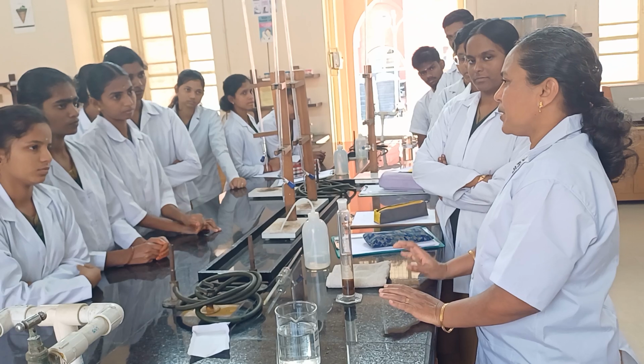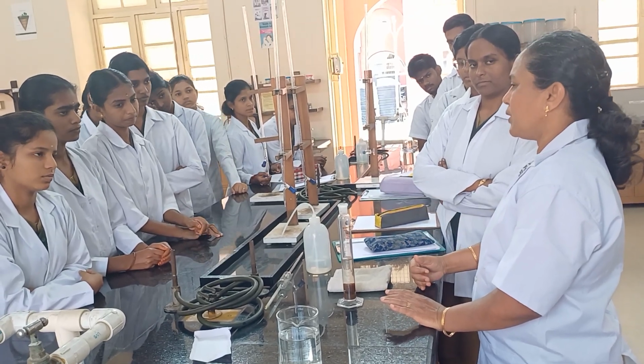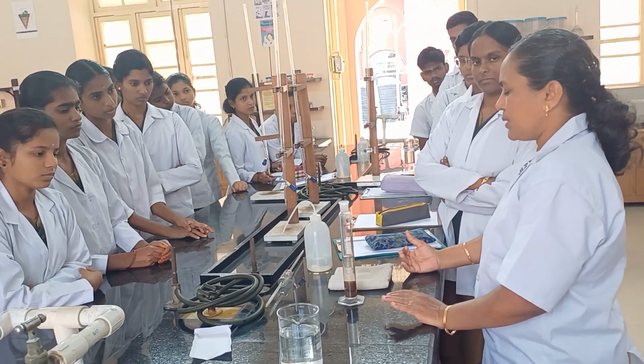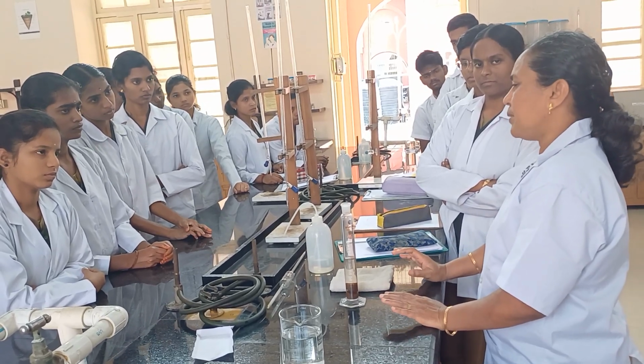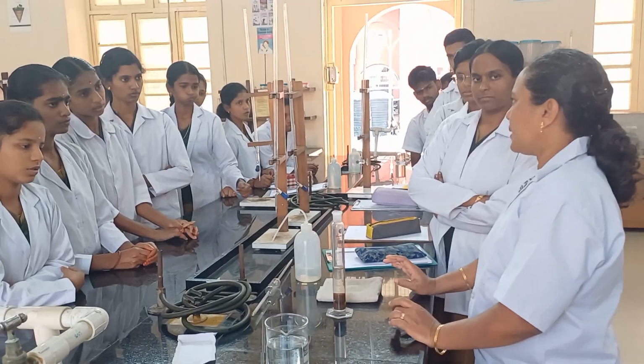And percent pore space is volume of pores divided by total volume of soil, into 100. That will give the percent pore space. So using this method, we can estimate all three parameters: bulk density, particle density and percent pore space.